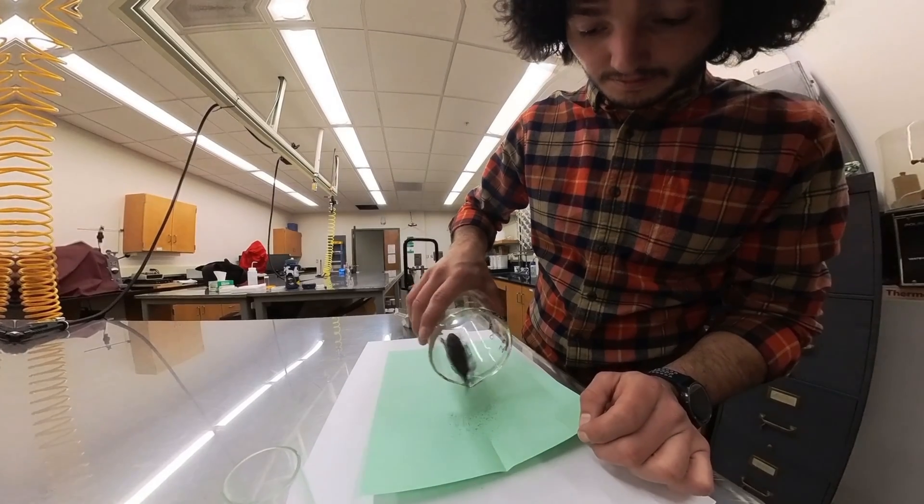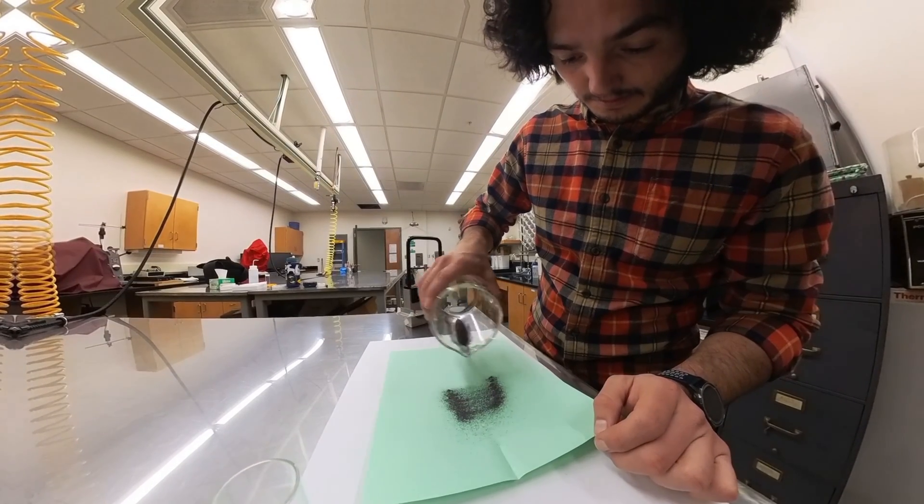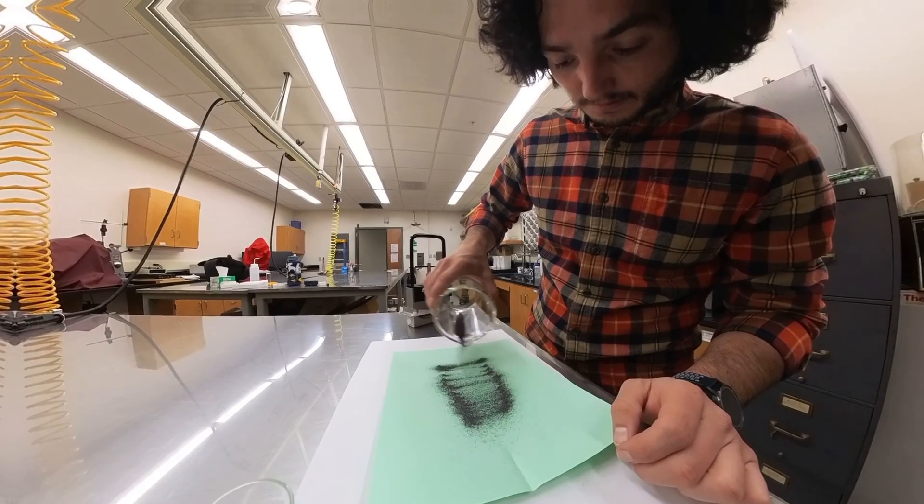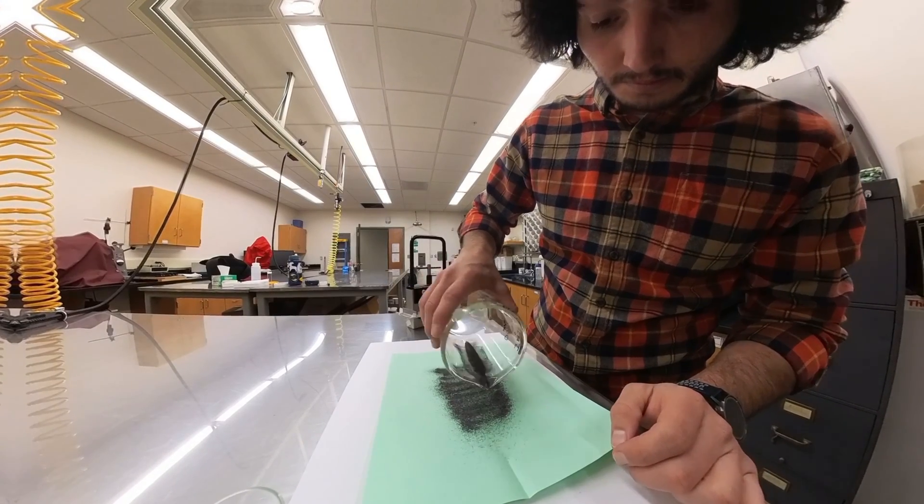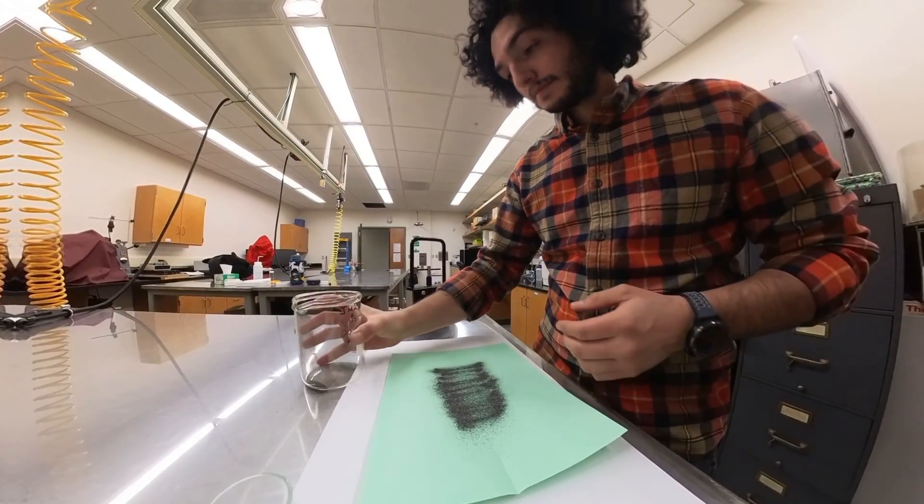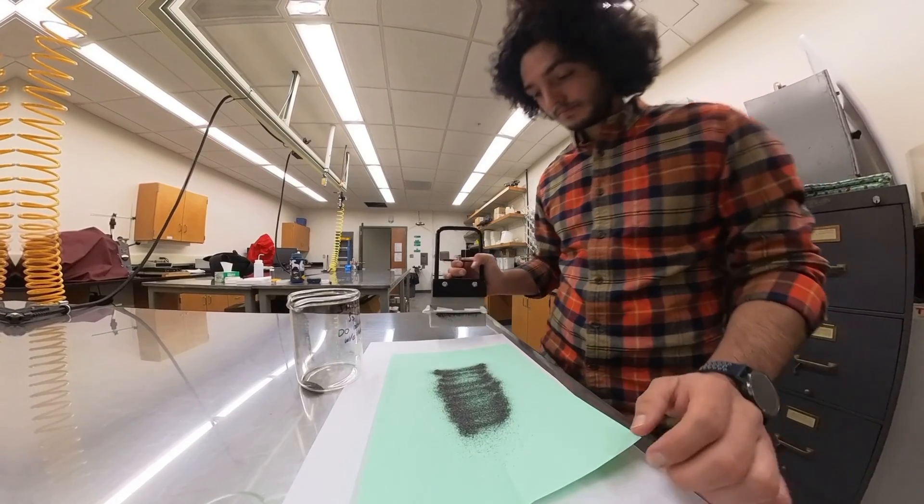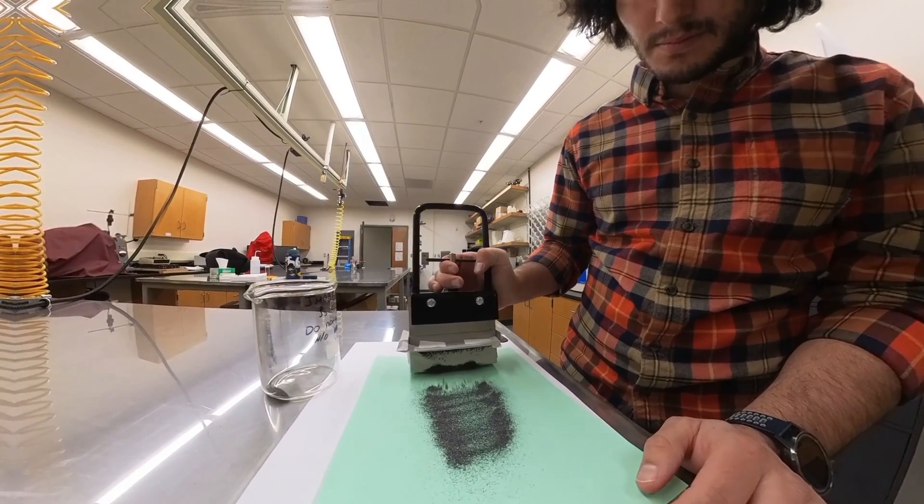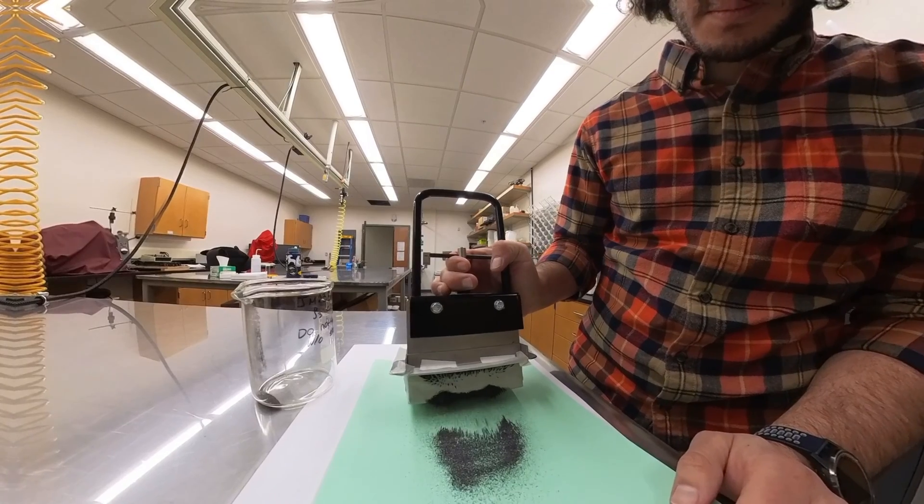From here, we dry out the now much smaller sample and spread it out. While it has many things, zircon is not magnetic. So by running a magnet over the sample, we can remove the magnetic grains, further zeroing in on our stubborn zircon grains that remain behind.